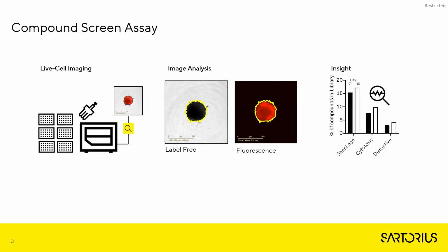So here the workflow depicts phenotypic screening, the use of live cell analysis to collect images that are quantified to provide insight into the compound's mechanism of action.